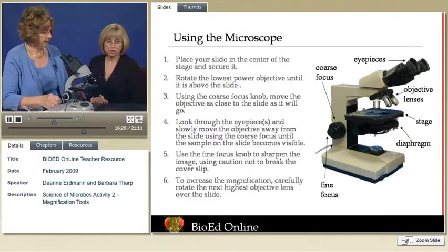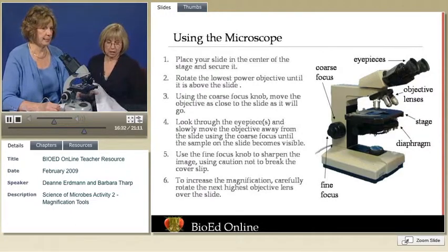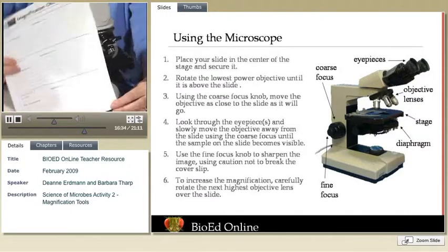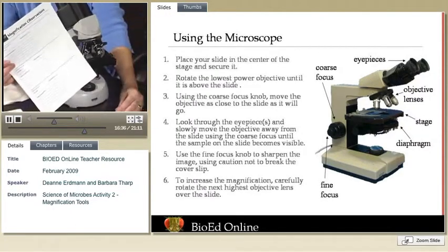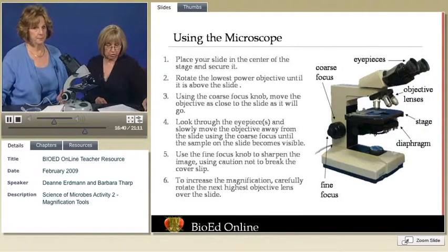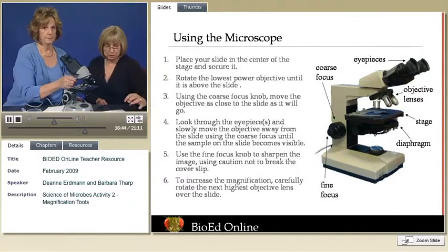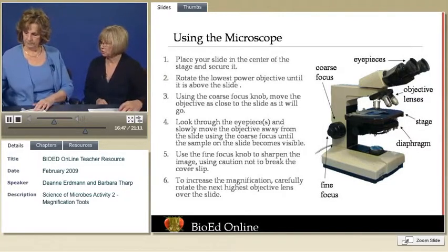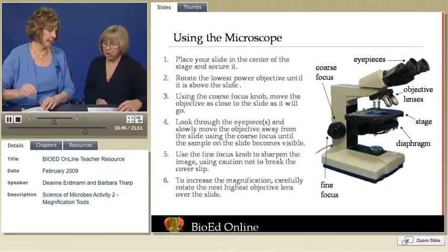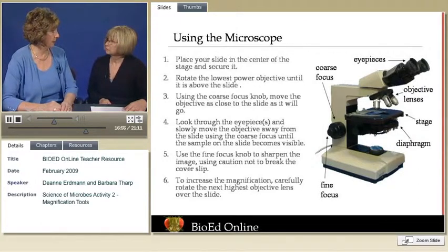So can you record that? I think so. That's what we'd want to do next, is to record this on the student sheet and make additional notations. They could compare the 3 different observations, 1, 2, and 3, and see what this magnification does. And what is the top magnification we're going to look at with the microscope, do you think? In this case, you can go all the way up to the highest power, which in this microscope is 40 times 10, which would be 400.